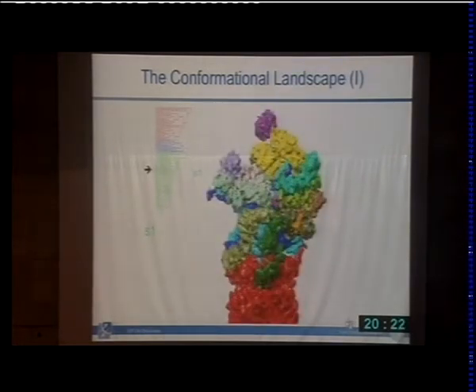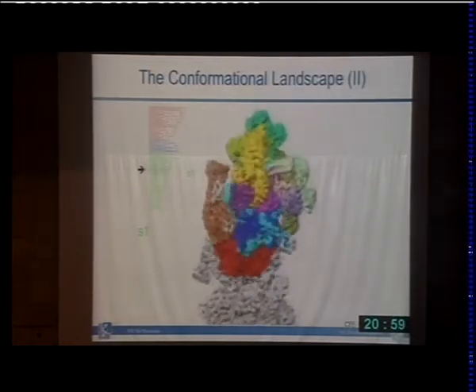But you must be aware of one thing, and that is that each of these conformations has still quite some heterogeneity. So we still average over an ensemble with some heterogeneity. So what it means is that basically it defines, let's say, the boundaries of the conformational landscape, but we morph here into each other, just the extremes. And it's also clear that morphing something into a seemingly logical sequence doesn't mean that we really fully understand the dynamics, but I think it gives you a pretty good feeling.